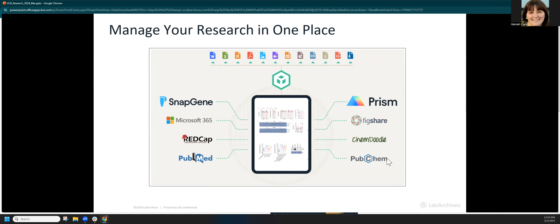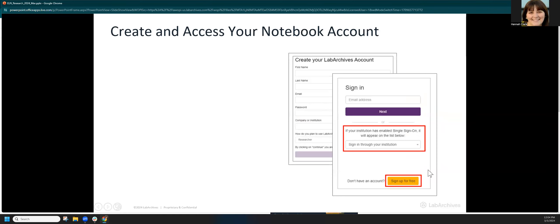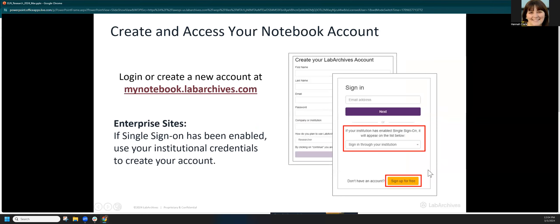We have integrations with other tools. If you work with SnapGene, GraphPad Prism, PubMed, REDCap, and others, these allow you to send data from those tools into Lab Archives — a great way to tie together your full workflow from data collection and experiment planning to data analysis. You can have files of any file type, so even if you're not a wet lab scientist or biochemist, it can really be data of any type. Reach out if you'd like to learn more about integrations.